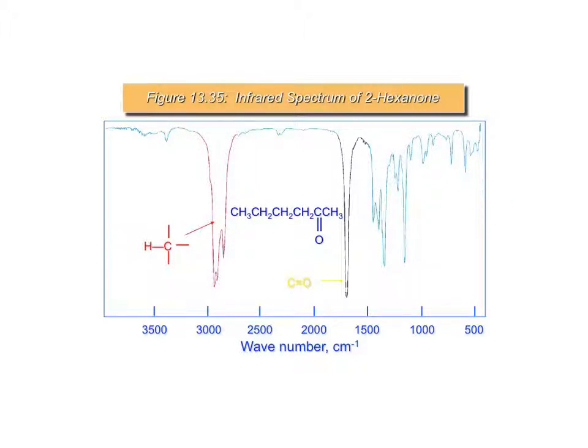And so that's why we can tell that if I gave you these two, I'd say, okay, these are the two IR spectra. One of them is 2-hexanol. The other one's 2-hexanone, a ketone. I would expect you to tell me, okay, match the one that was the alcohol because it has the big dip. Okay, and so that's pretty much the extent of what I want you to know, the fingerprint region.